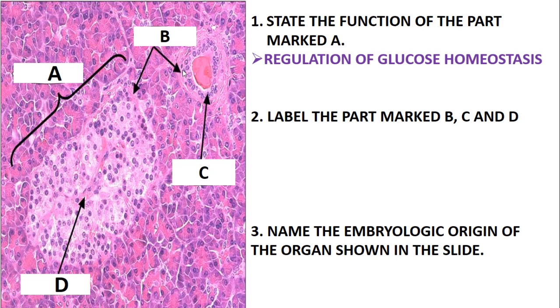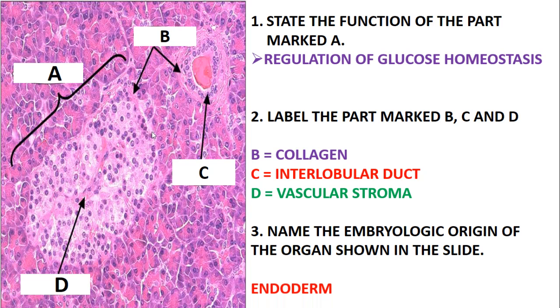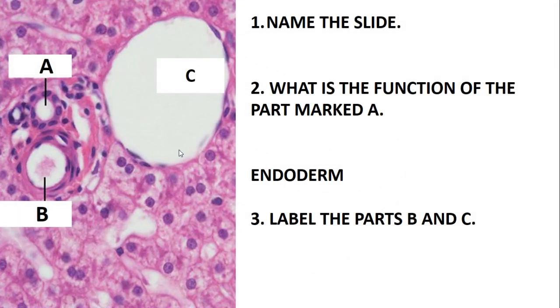Now for the parts marked B, C, and D: B is just collagen. C is just the interlobular duct. D — some people might make a mistake and say D is the islets of Langerhans, but no, D is a part within the islets of Langerhans; D is simply the vascular stroma. The embryonic origin of this organ — the pancreas — is the endoderm.